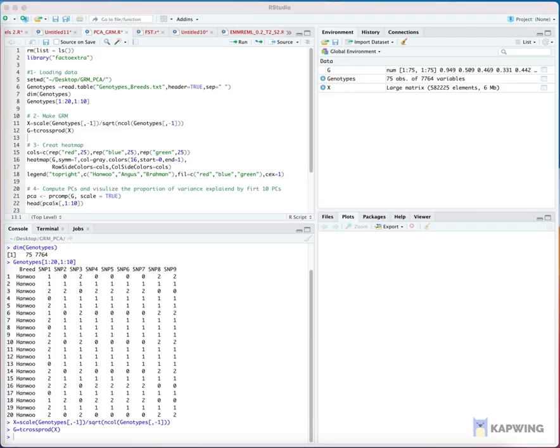Step 4: Visualizing diagonal and off-diagonal elements of the GRM matrix using a heatmap function.